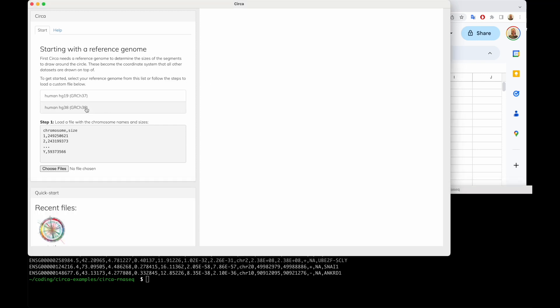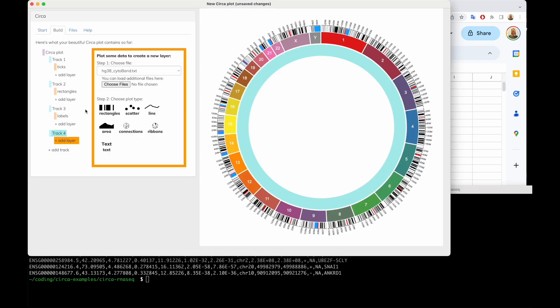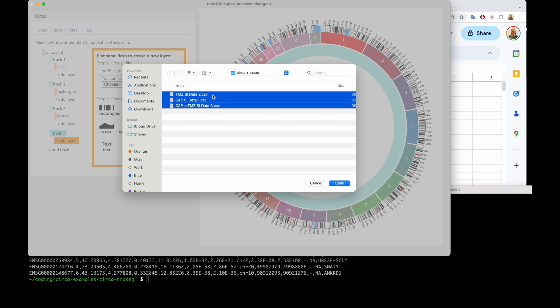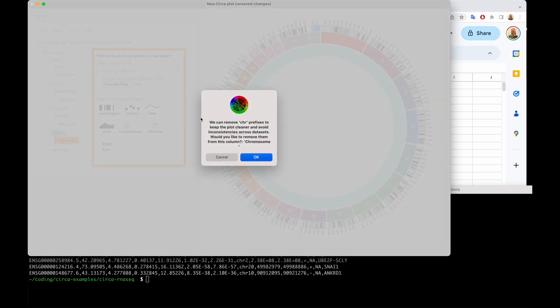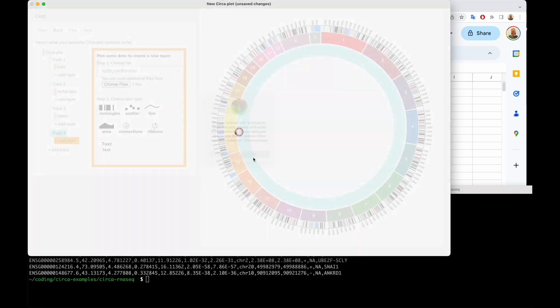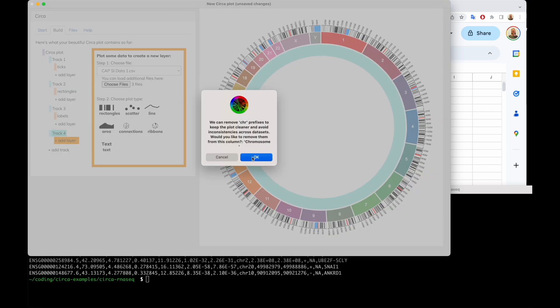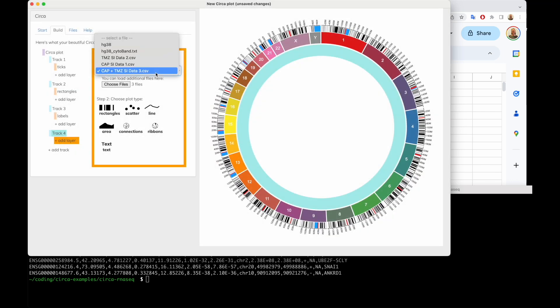I'm going to assume that this is GRCh38, so I click that and it gives me the chromosome sizes, ideogram, and everything. Then I can go and choose some files — I'm going to choose all three of these files and open them all. It asks to remove CHR prefixes, which we do just to keep it nice and clean looking.